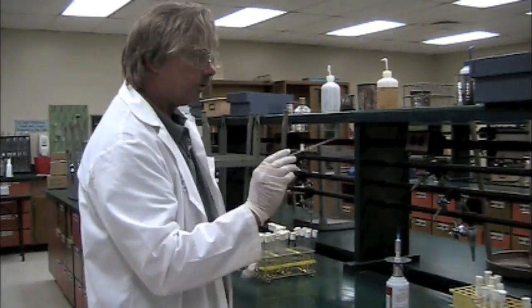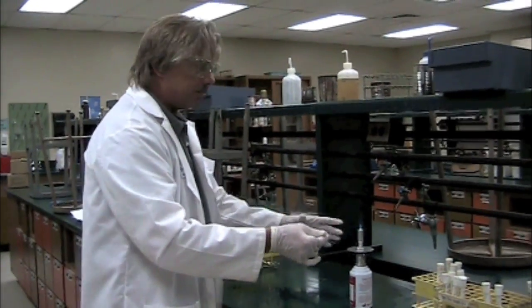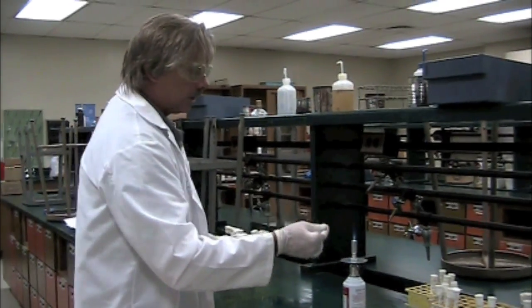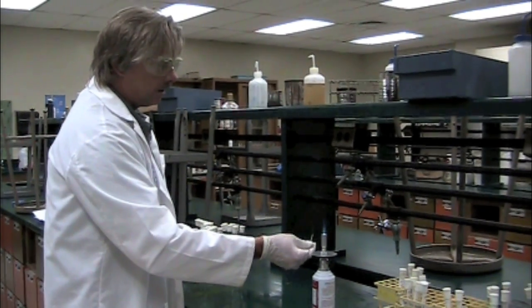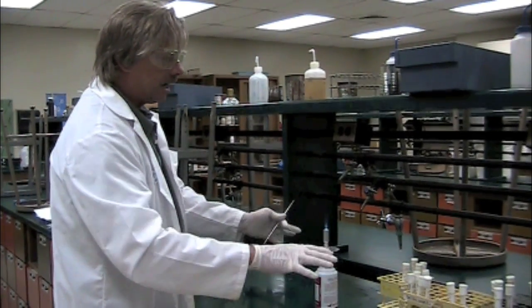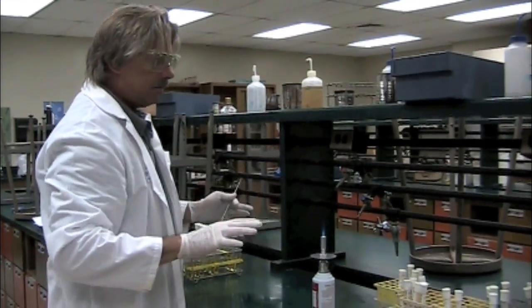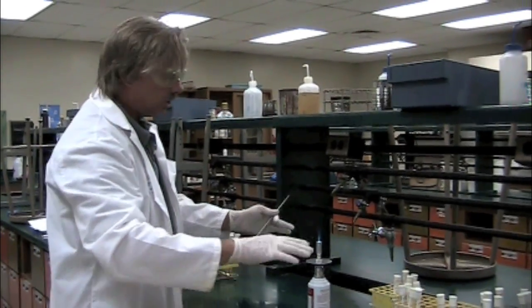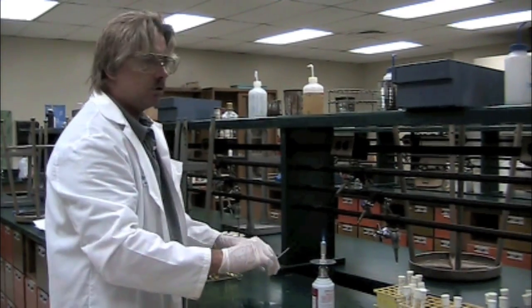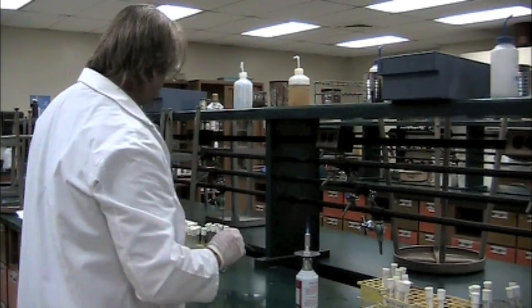So before I make the transfer, I need to cool this down a little bit. The environment around this flame is the most sterile. I can't hold it up next to me. I'm shedding organisms, okay? I want to let this inoculating loop cool down close to the flame. The reason being is this hot flame is actually bringing in air like this and throwing it up and out. So any bacteria that I'm shedding, or your partner might shed, is going to fall into this area and actually be carried away. Even you'll notice as I'm making this transfer, I'll be working close to the flame.